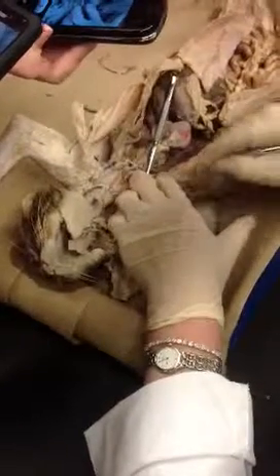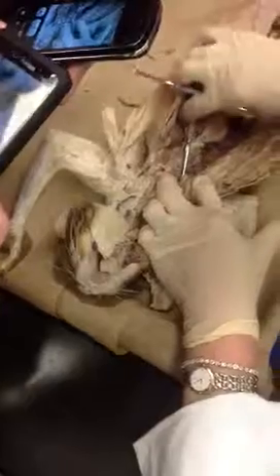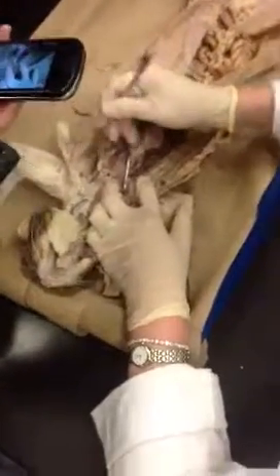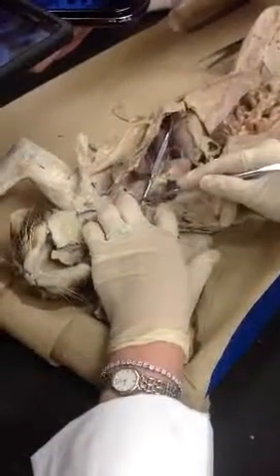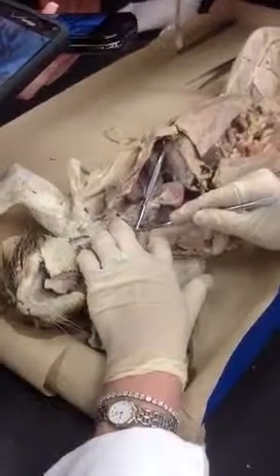So this white thing is just perfect. There's your internal mammary, here's your vertebral, costocervical, thyrocervical. And yes, they're tiny, but we would pull them up like this, so you can see all 3. I understand what you're talking about, because I do the same thing. 1, 2, 3. And it's on both sides, so you might find that over here it's clearer than it is on the other one. But they're in that order always. The one innermost is the vertebral, and it's right across from the internal mammary. Costocervical is the loop. Thyrocervical is this next one.